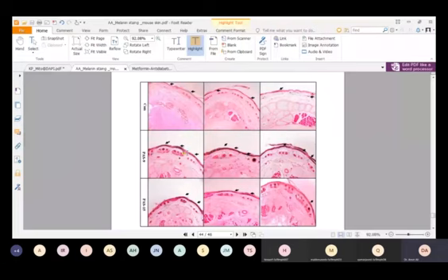And this also means that Fontana Mason staining stains the melanin content perfectly. It is very clear from these images. And here too you can see some dark layer, which is of course melanin. So what you learn here is that you can stain particular pigments like melanin in a tissue sample. And this staining technique is very helpful for collecting useful data. As they wanted to study the plasma effect on melanin, this staining technique helped and gave very useful data.